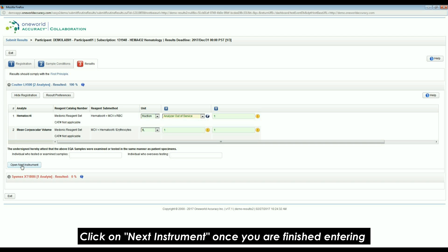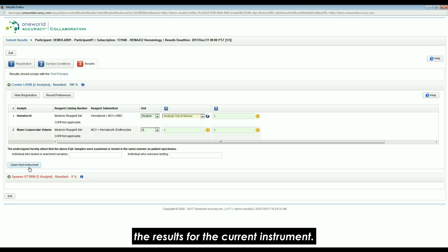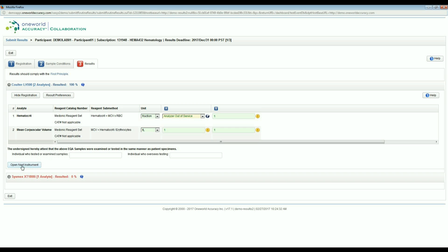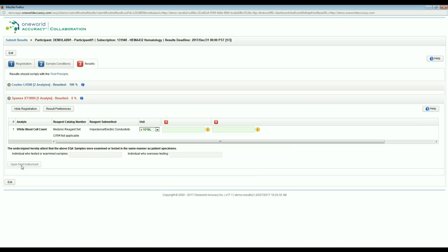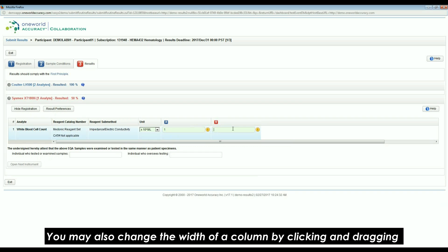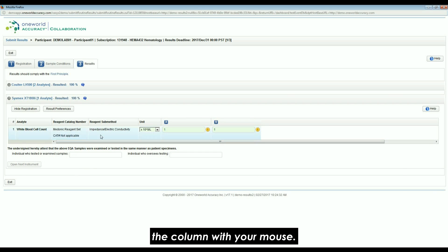Click on Next Instrument once you are finished entering the results for the current instrument. You may also change the width of a column by clicking and dragging the column with your mouse.